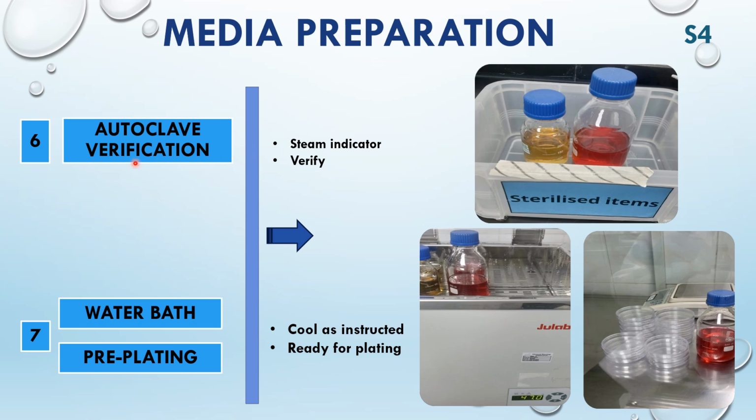Now the media is boiled and sterilized. We go to the water bath, and I recommend 44 to 47 degrees. We need to place the media in a water bath at 47 degrees temperature, and keep it in the water bath until we go for plating, because cooling of the media is very important. Otherwise, there is a lot of moisture in our plates if we go for direct plating.